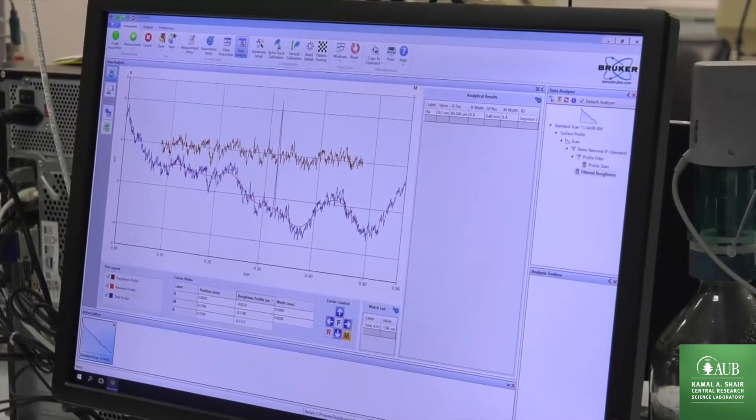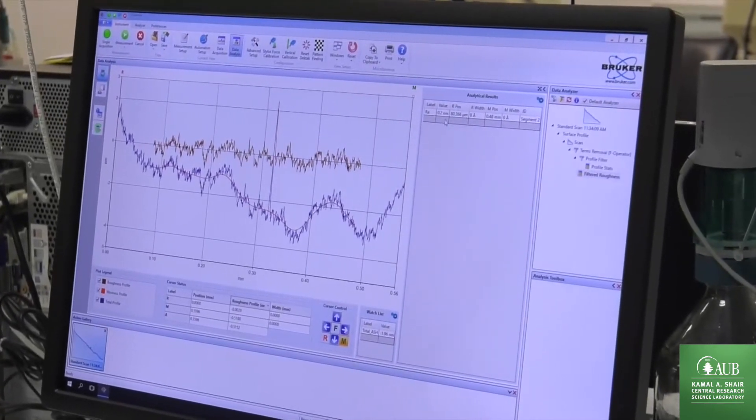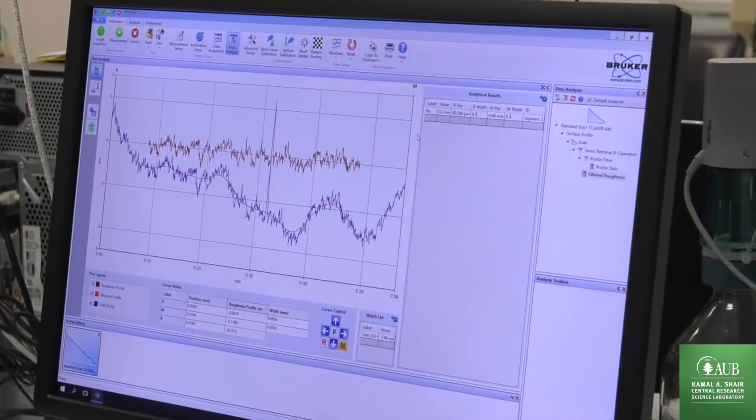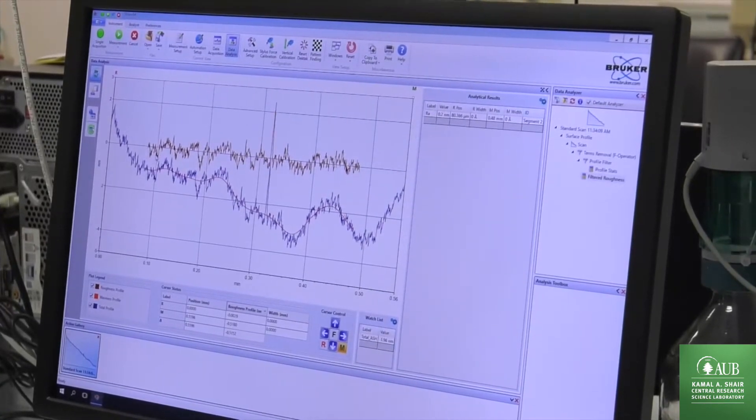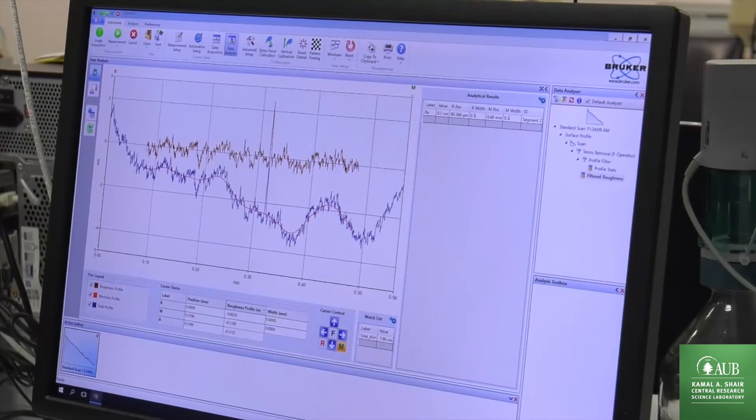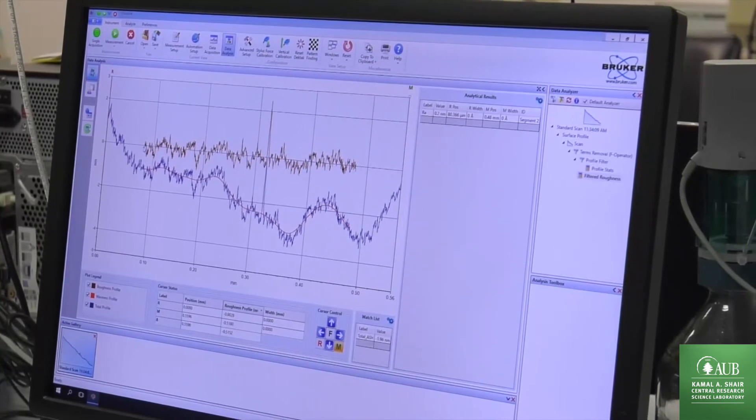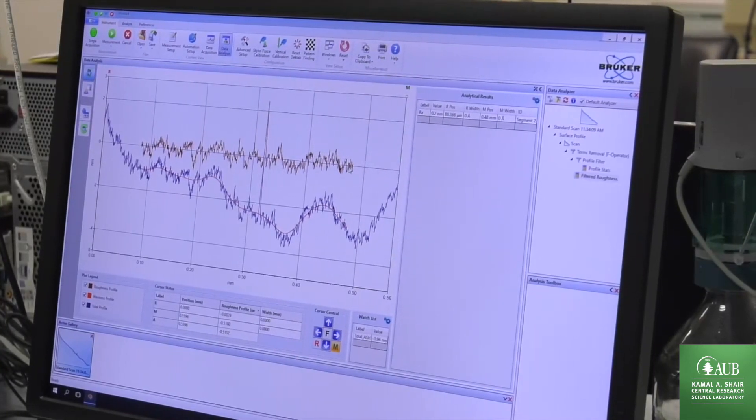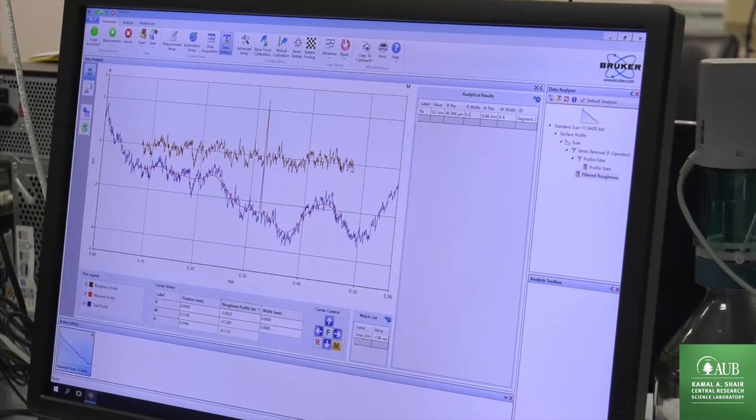And now I will always find my roughness, my RA roughness, measured according to the ISO norm between 1 seventh and 6 sevenths of the scan length, which has also been selected based on the ISO norm.